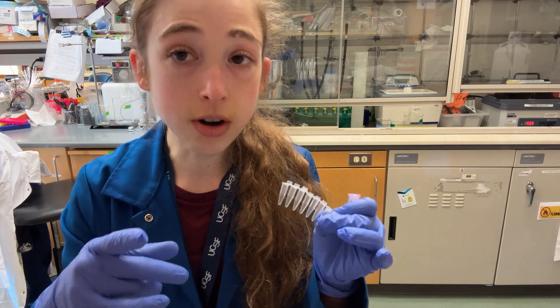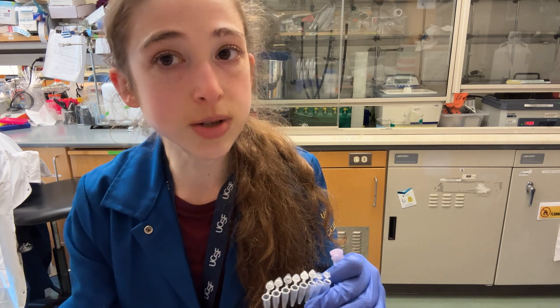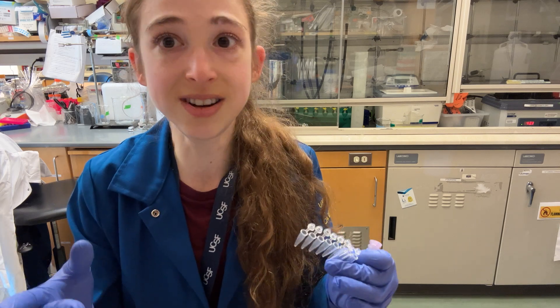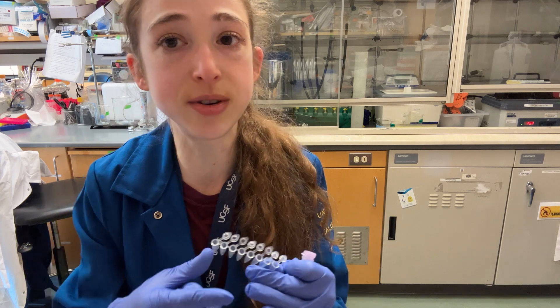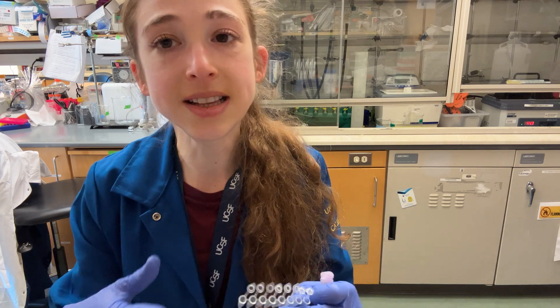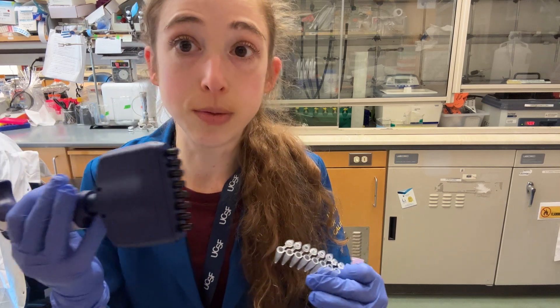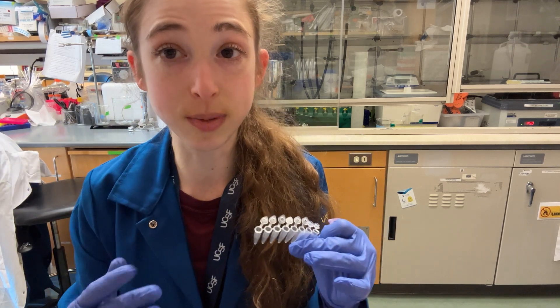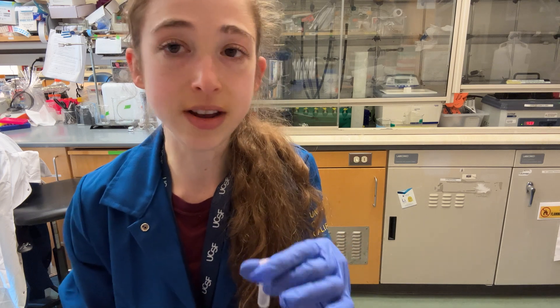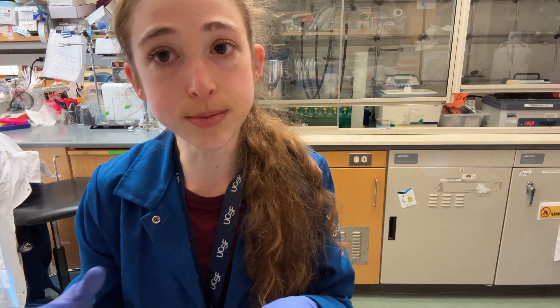So remember: do your optimization at the smaller volume and optimize so that you get a specific band. Don't worry too much if that band isn't very bright. If the band isn't bright enough, or you just need a lot of it for something, just pool reactions together. You don't have to pipette out each individual reaction separately — instead, just make a larger volume and split it up into multiple tubes using a multi-channel pipette. Then at the end, pool them all together, purify them together, and elute in a low volume if you want a high concentration. And you've got a lot of your PCR product without the risk of mutations from increased cycle number, or non-specific products from increasing the amount of stuff in there.